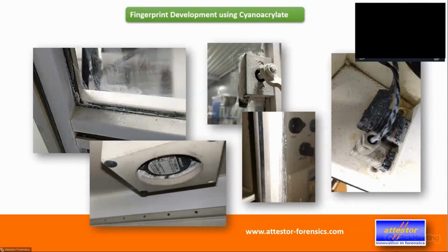This is really, really old cabinets from different vendors, different manufacturers, in all sorts of places where we have been going to. And when we designed our system, we said, look, in the beginning of cyanoacrylate fuming, it was all about keeping your cabinet clean. Meanwhile, all the accredited labs, at least, and everyone who is a qualified sub-supplier to an accredited lab, needs to also work DNA safe.